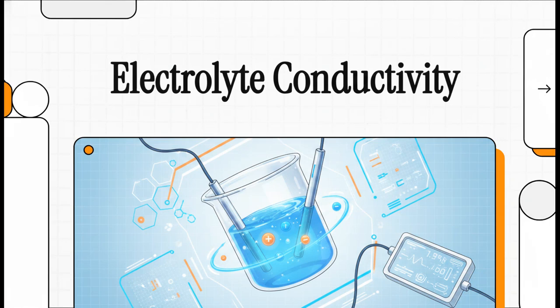I'm Dr. Chem, and we are treating today's session like a virtual laboratory experiment. We're going to be diving right into the conductivity measurement of electrolytes. Basically, we're exploring exactly how we measure the electrical conductivity of different solutions and figuring out how, exactly, ions allow electricity to just flow right through liquids. It's a fundamental physical property, but seeing how scientists and engineers actually capture these measurements is absolutely fascinating. So let's get into it.